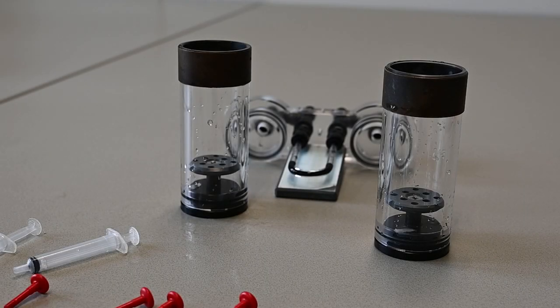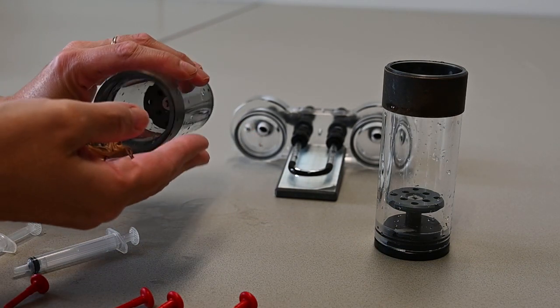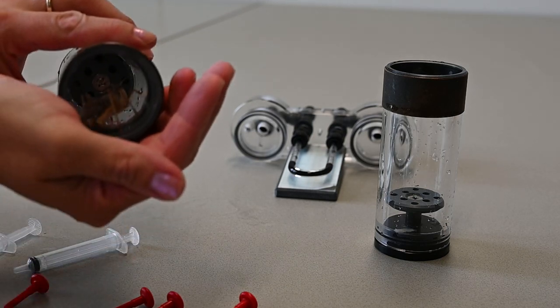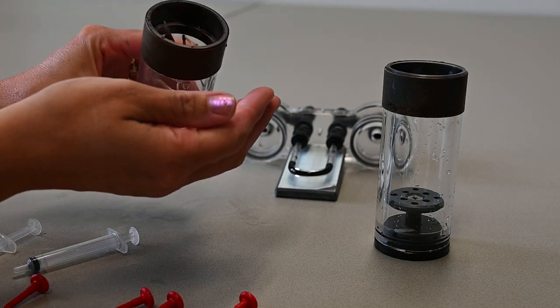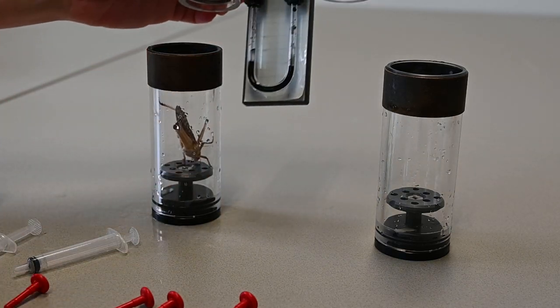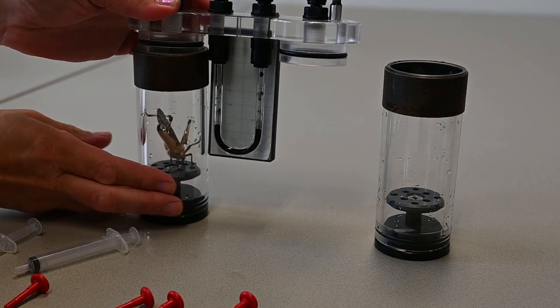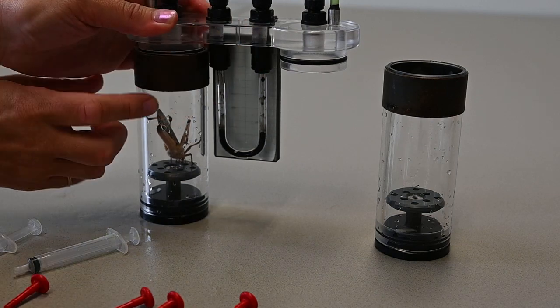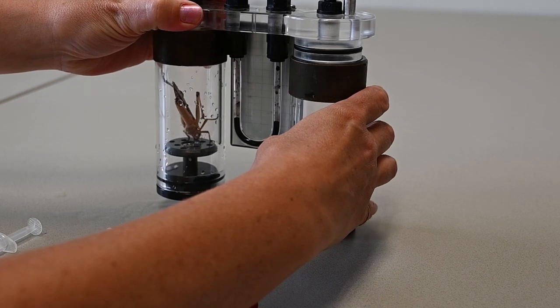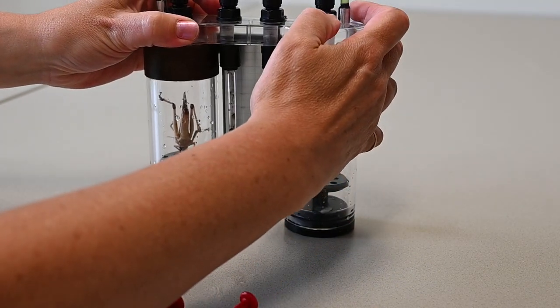The locust is placed head down in the left cylinder. Then the cylinders are attached to the system.